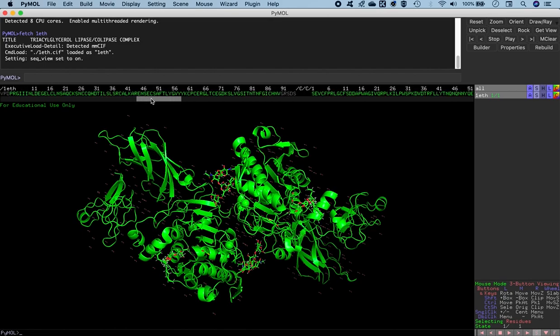And if we go further down, colipase is a short chain actually. And then from 91 onwards until the 95th residue, you see all these residues are missing here as well, which are all shown in gray. So all the residues that are missing will be shown in gray in the sequence, and we can always reconstruct or model these residues by using the PyMOL builder function here, which we'll see in a minute.